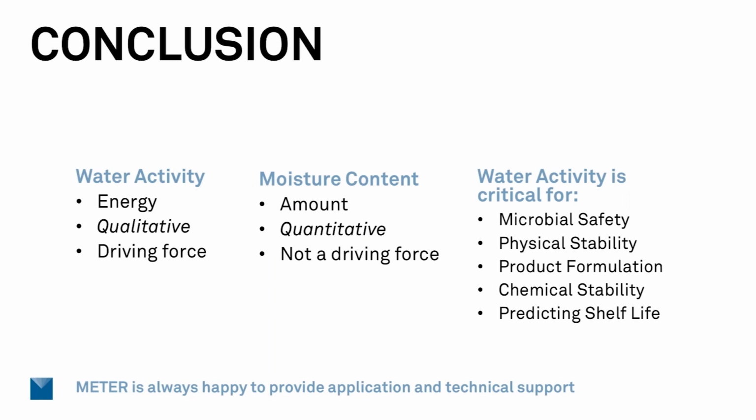Water activity can also be a specification set for acceptance tolerances. You could say, okay, we can accept a water activity of our incoming raw ingredients in this range, knowing that when you put them together, you're not going to have any problem with moisture migration and other issues.